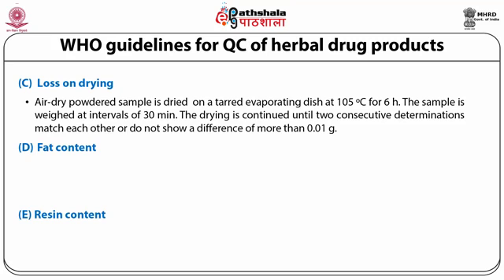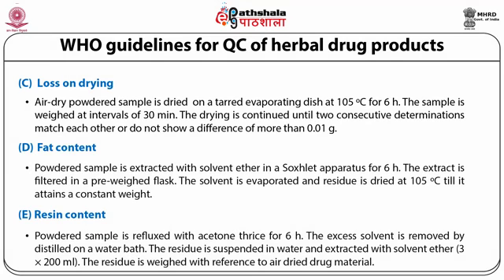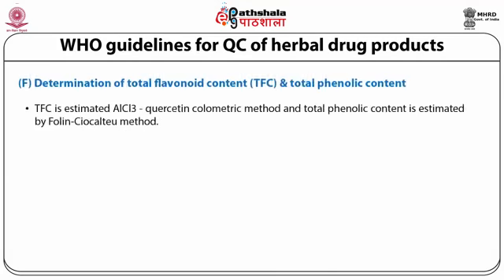There are also certain contents that are taken into consideration for quality control, like fat content, resin content, total phenolic content. In all these determinations, the samples are extracted or tested for fat, resin, or flavonoids or phenolics to determine the content of fat or respective substances.